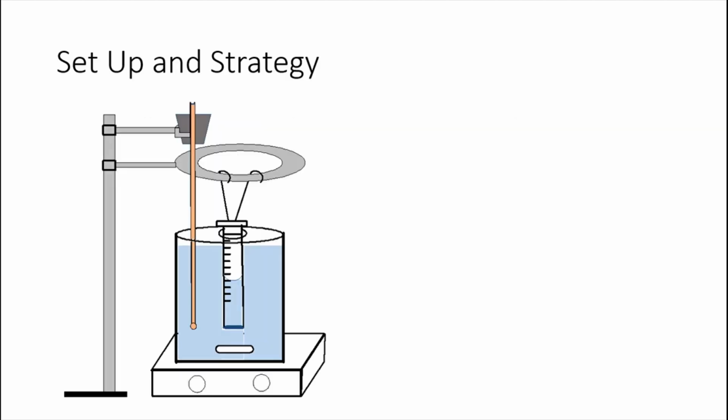You all remember our setup for the experiment. It's a suspended graduated cylinder that has a bubble of air inside of it. And as the water is heated, the temperature increase causes the bubble to expand, both because the air inside expands and because water vapor begins to accumulate in there.